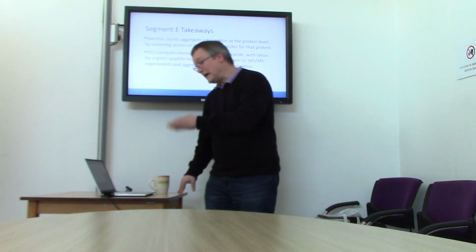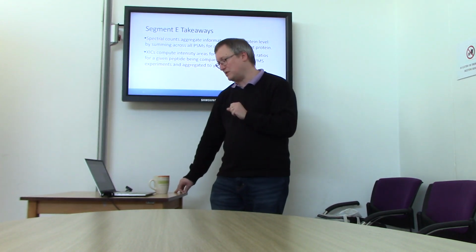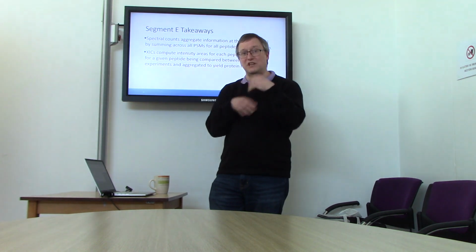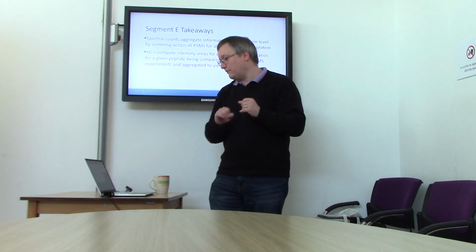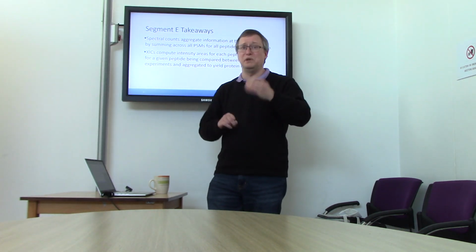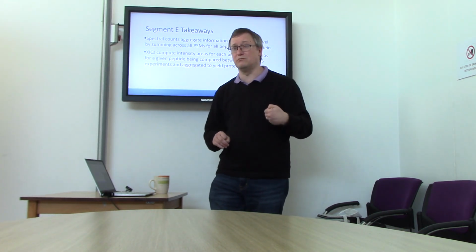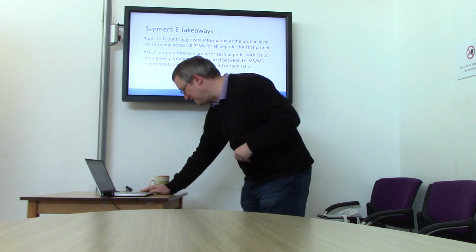Okay? XICs are going to compute intensity areas for each peptide. They'll probably compute ratios for these peptides, and from that try to give you an aggregate protein ratio built from peptide ratios. Okay? Hanging in there? Doing all right? Good. Excellent. On we go.